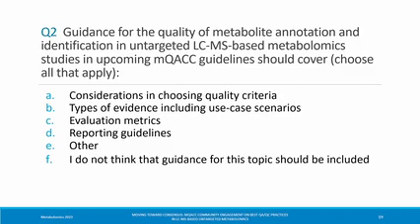Hi, my name is Catherine, I'm with Sigma. I feel like it's a little bit obvious for the first one that it's going to be mass accuracy, right? So ppm thresholds, I think, are very important. In addition, I like to have at least 2 confirming fragmentations, so 2 fragments that match the database, not just the parent, but hopefully 2 actual fragments. And then I also like to have technical replicates of that. Some people don't think that's necessary, and that's fine. But I think your system should also be evaluated to make sure you're actually getting those fragments reproducibly. So that's mine.